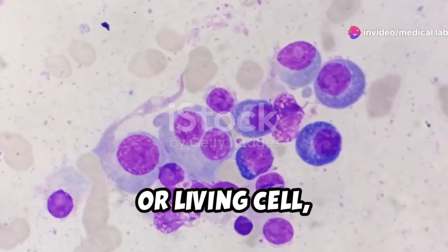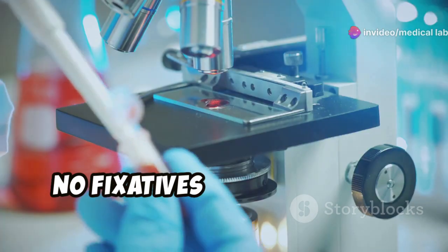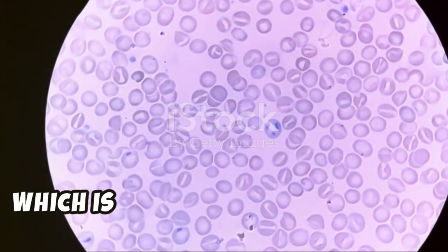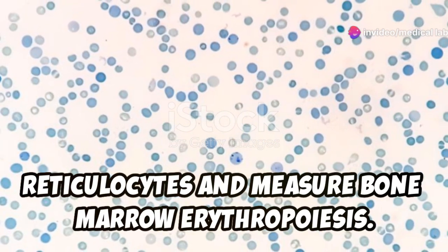Supravital or living cell monochrome stain is used to stain specific cellular components. No fixatives are used in the staining process. Examples include new methylene blue, which is used to precipitate RNA in reticulocytes and measure bone marrow erythropoiesis.